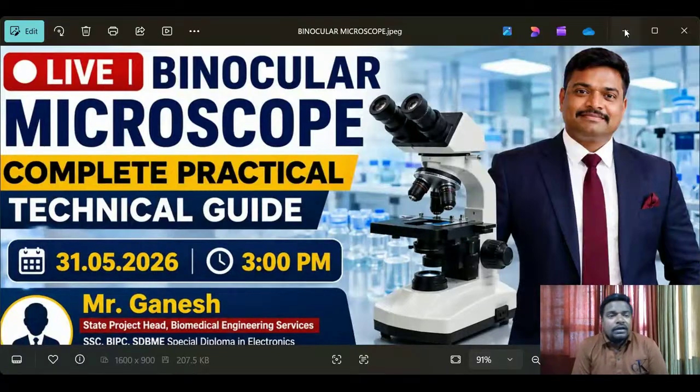Today we successfully completed a live session about the binocular microscope, a laboratory equipment. I have experience in biomedical engineering with ICU equipment, operation theater equipment, laboratory equipment, dental equipment, and radiology X-ray equipment. I'm going to explain basic things for all of these, because my complete intention is that every biomedical engineer should have basic knowledge to perform their work.